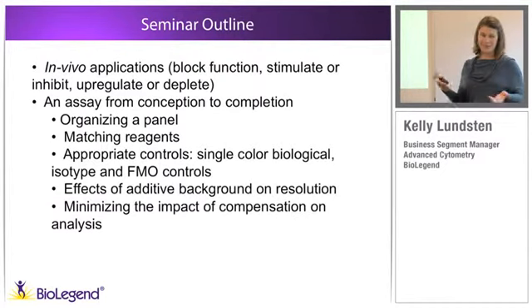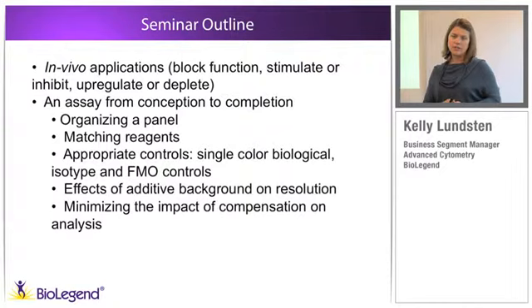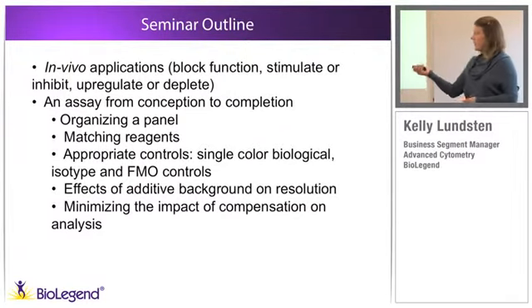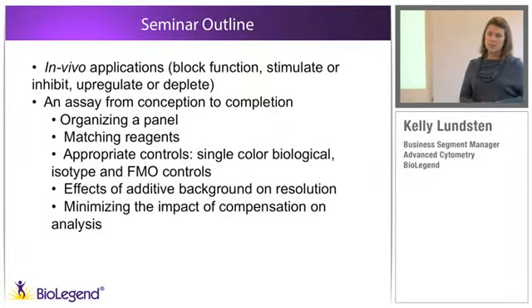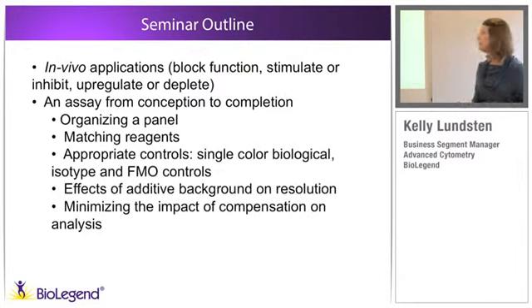So we're going to discuss something called photon counting error, which is a digital distribution of error because of our inability to appropriately account the validity of a single photon. But we'll get into that a little bit later. It is actually an artifact of applying compensation. So in the context of these multicolor applications, how do we minimize the effect that compensation has on our ability to, again, get internally consistent, resolvable data?